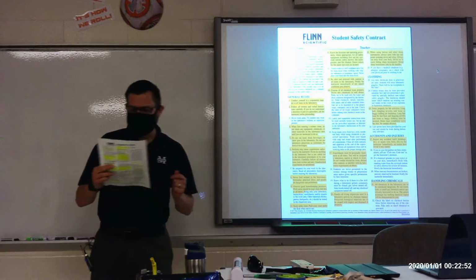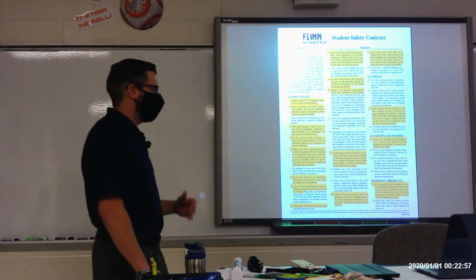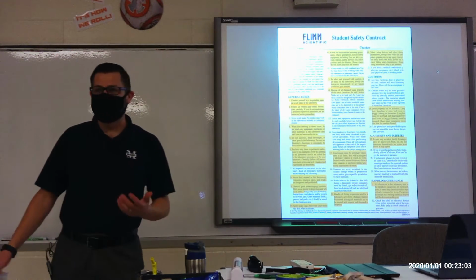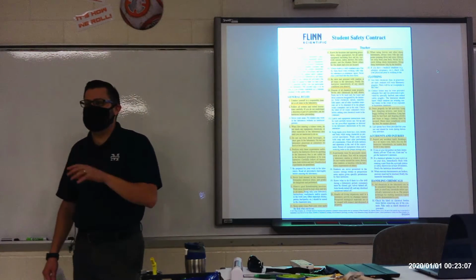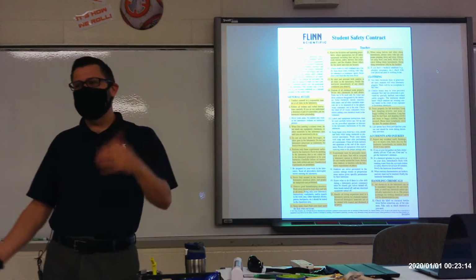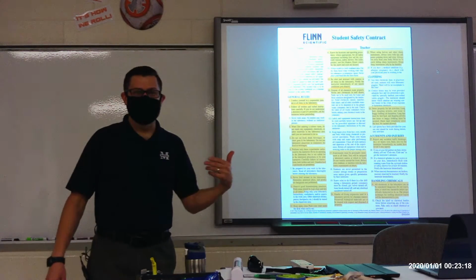Number 14, dispose of all chemical waste properly. Never mix chemicals in the sink drains. We don't have too much occasion to use dangerous chemicals in here. Periodically we'll use kind of household stuff like vinegar or whatever. I will always give you directions as to how to dispose of materials. So if we're doing an experiment that has some sort of liquid, I'm going to tell you, yes, you can dump that down the drain, or no, we need to put it someplace else.